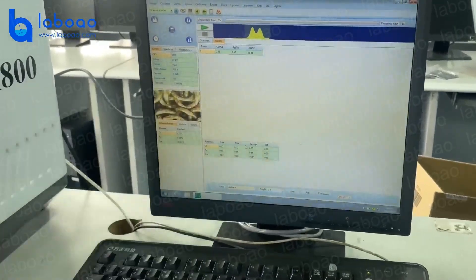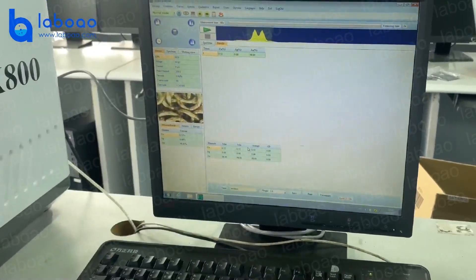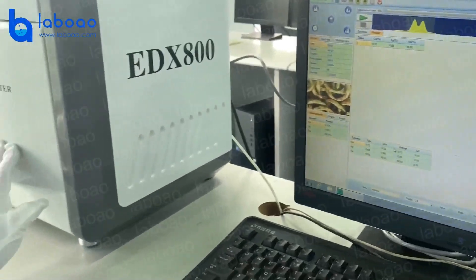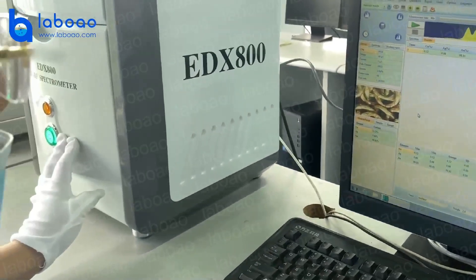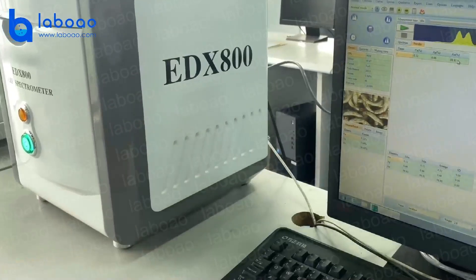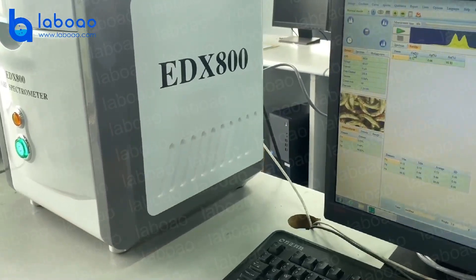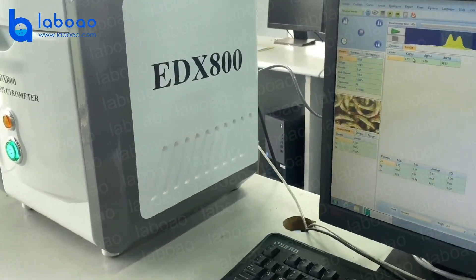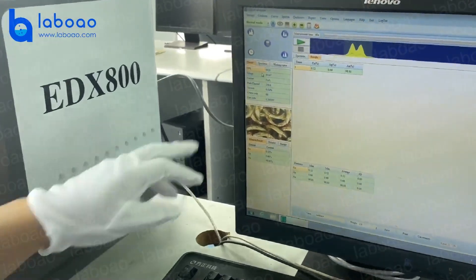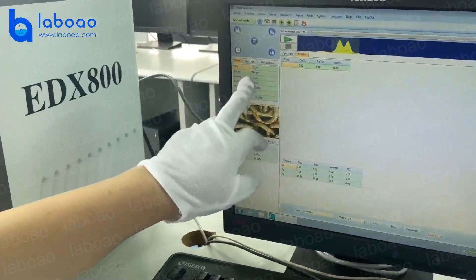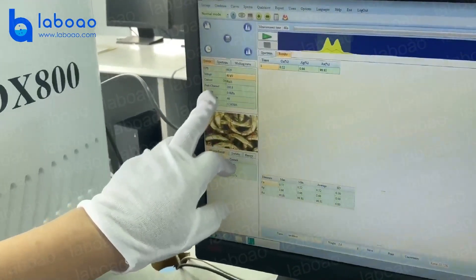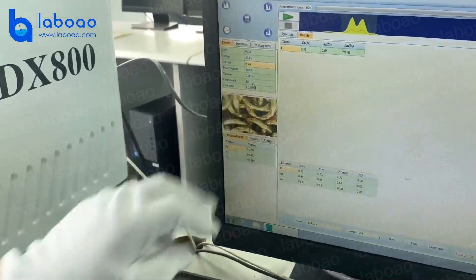This model is the cheapest in the world. It focuses on precious metals — Au, Ag, copper — and can also test nickel and zinc. Here we can see the CPS of the machine; voltage and current are also shown as machine information.